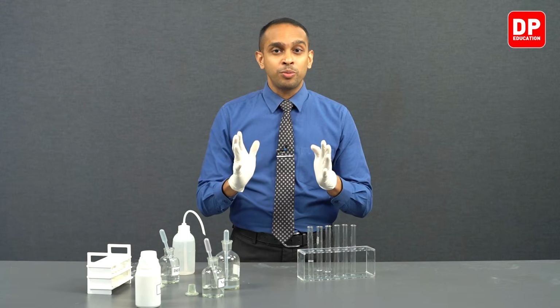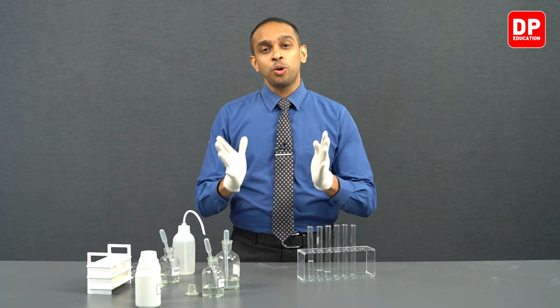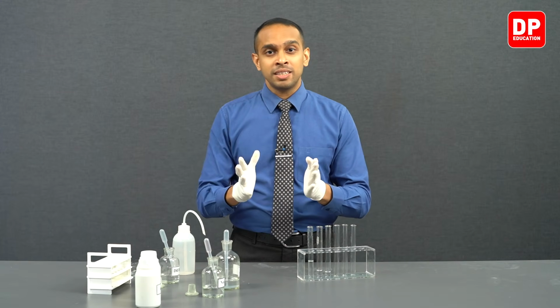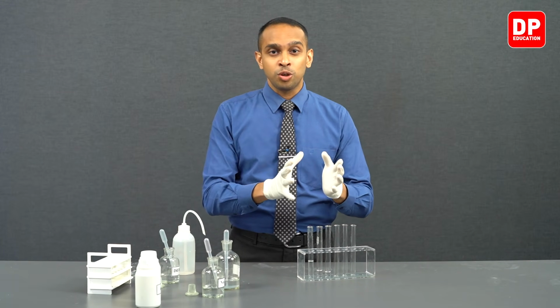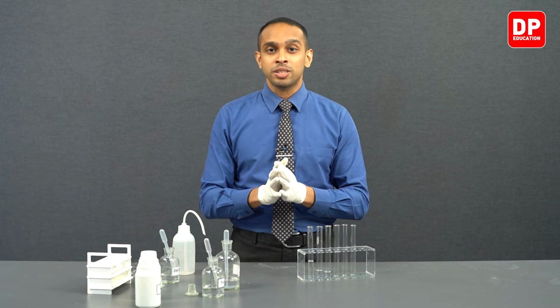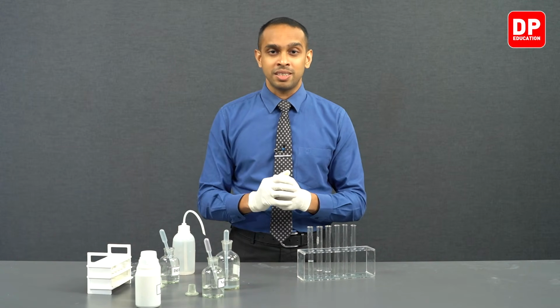However, apart from aluminium ions, zinc 2+ ions will also behave the same way. When you add hydroxide ions to zinc 2+ ion solution, you will see the formation of zinc hydroxide, a white color precipitate. However, zinc hydroxide will react with further or excess sodium hydroxide to form sodium zincate, which is a water-soluble substance.